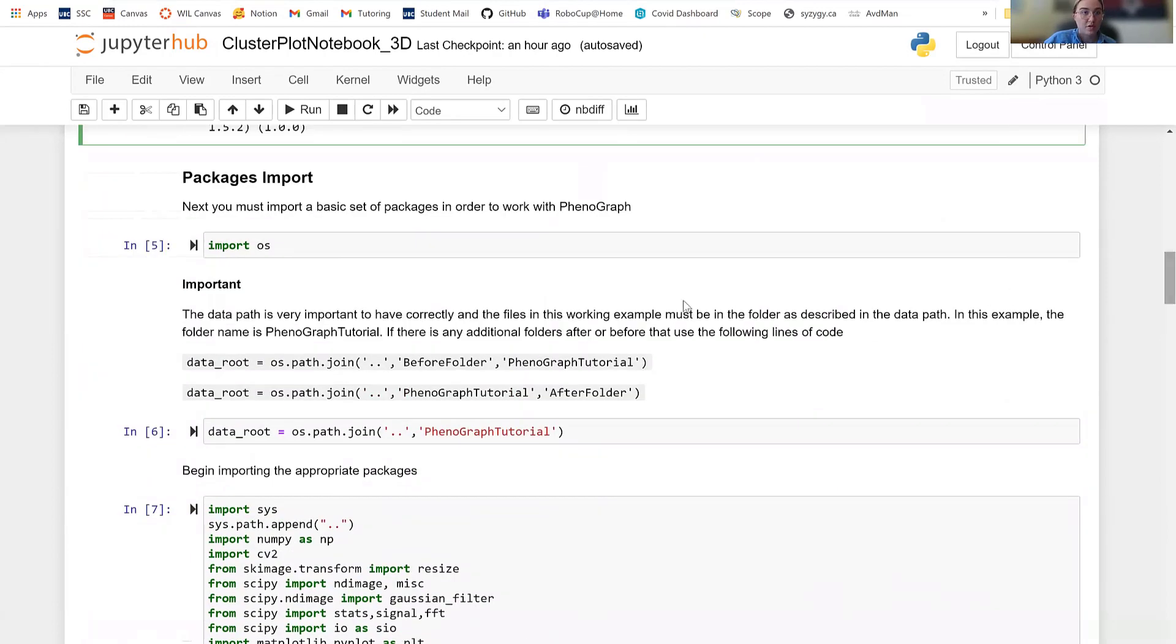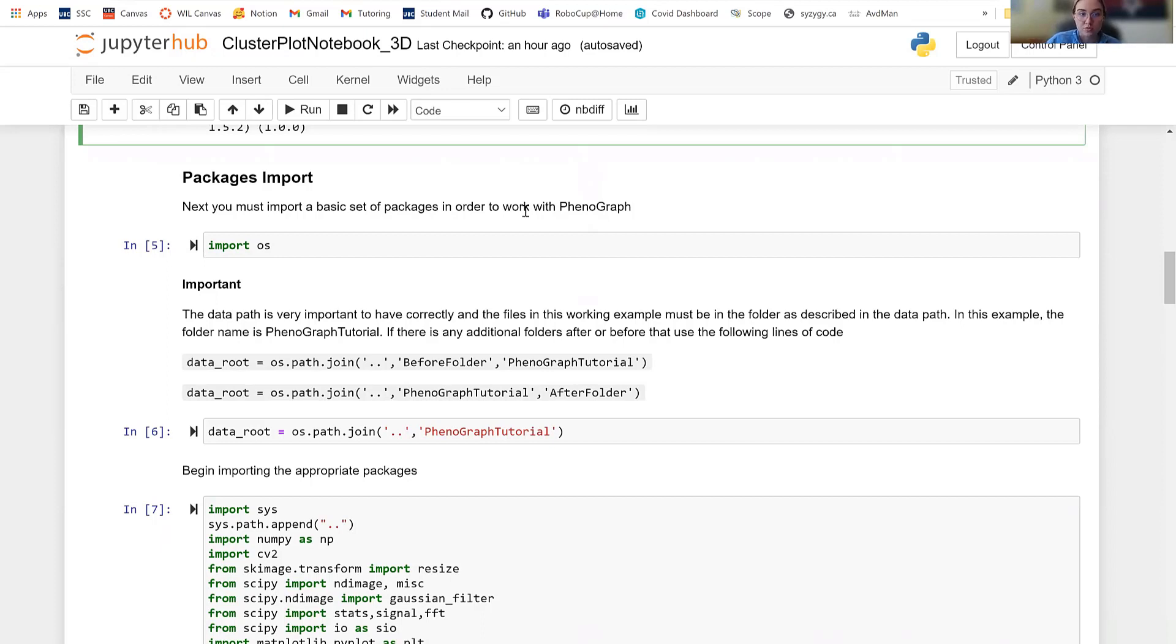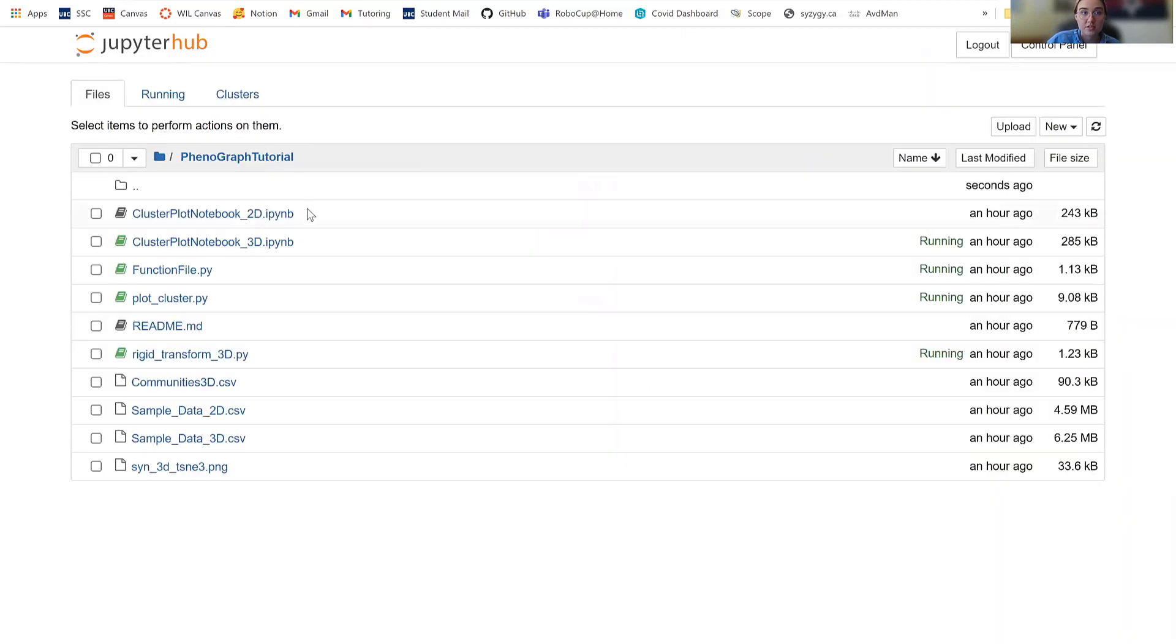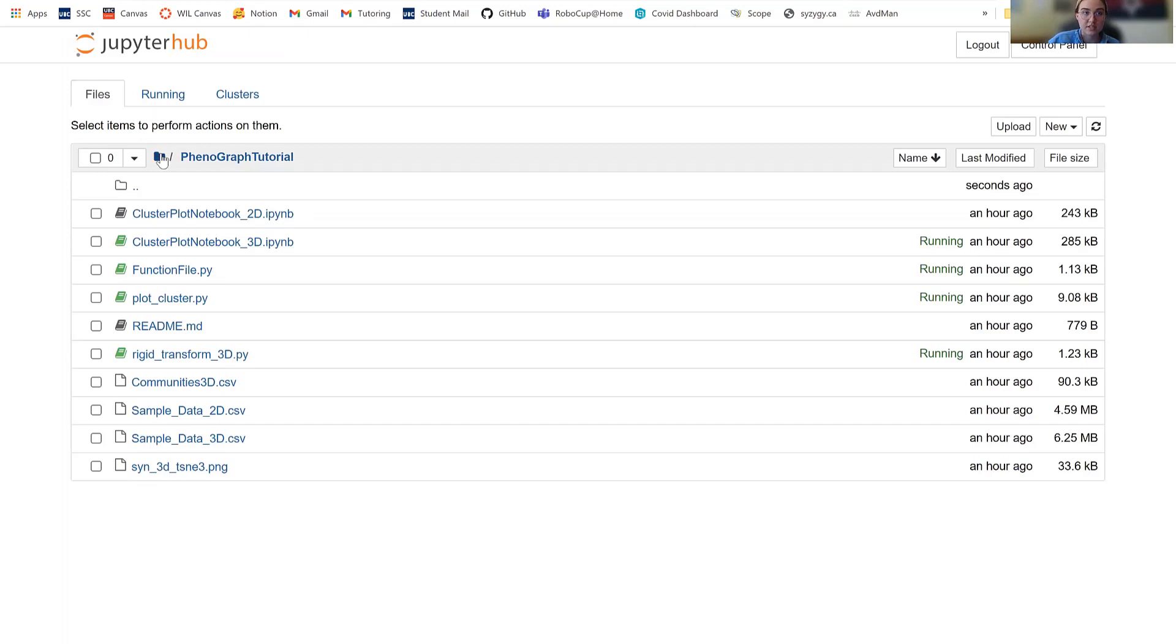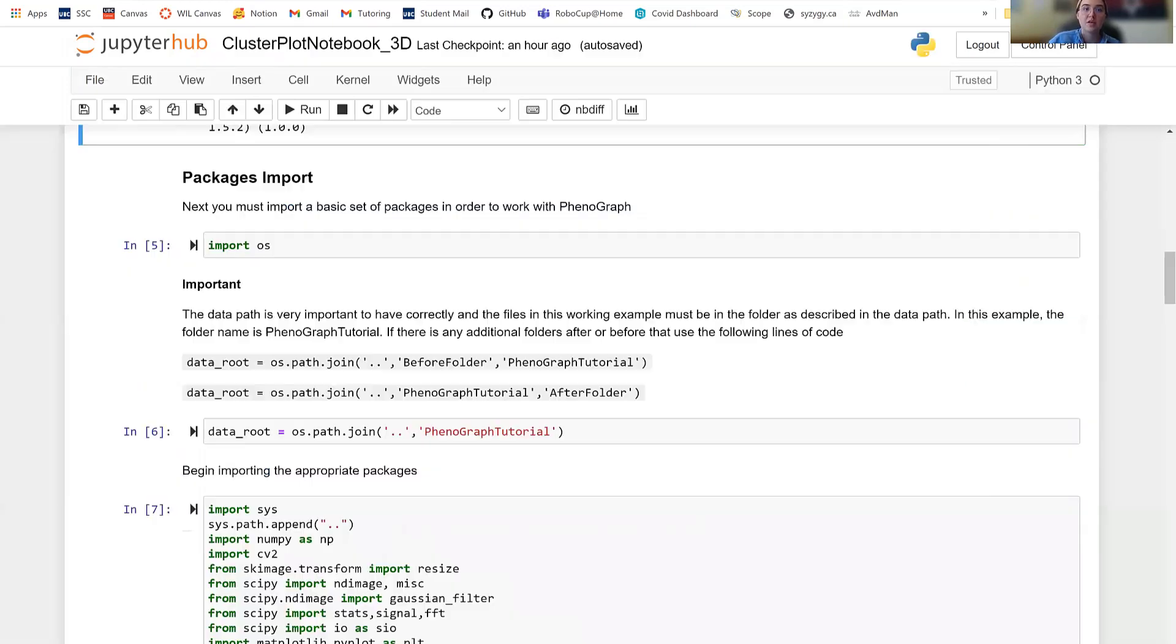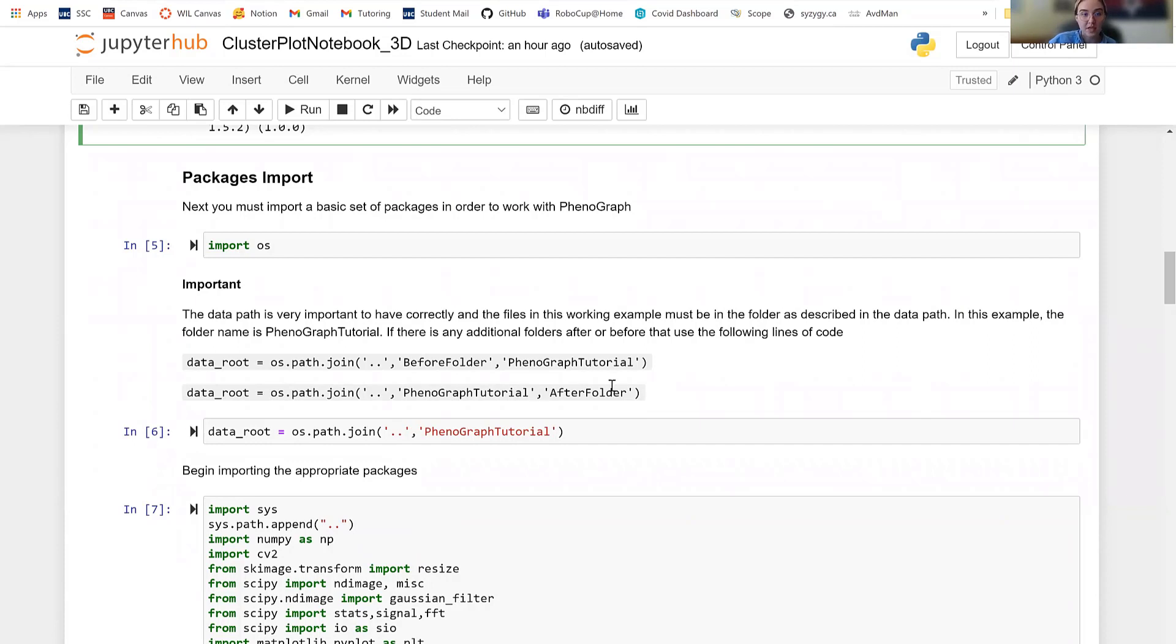Moving forward, you're going to import OS, which is a basic package that you should be familiar with. And then most importantly, we're going to go to the data route and set our data path. Now, as you can see here, I have Phenograph tutorial as one of the first, is the first package or first folder in my Syzygy directory. So if I was to click this, it would go back to my Syzygy home page. So here I have Phenograph tutorial, and then I put dot dot, which is the starting for Syzygy, and then I put Phenograph tutorial, which is the name of my folder.